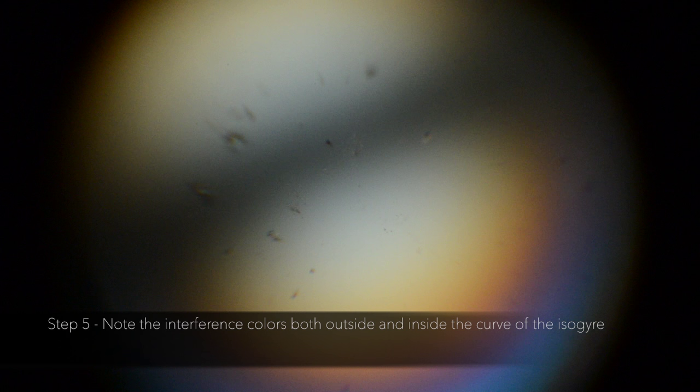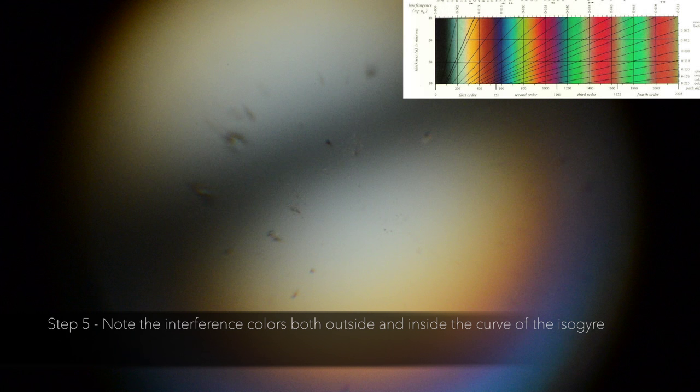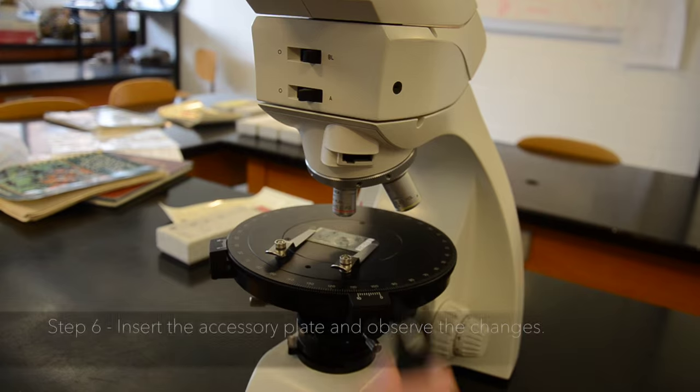Step 5. Note the interference colors both outside and inside the curve of the isogyre. Here, both sides have a range in first order isochromes. We see white, yellow, and magenta interference colors appear in that order.